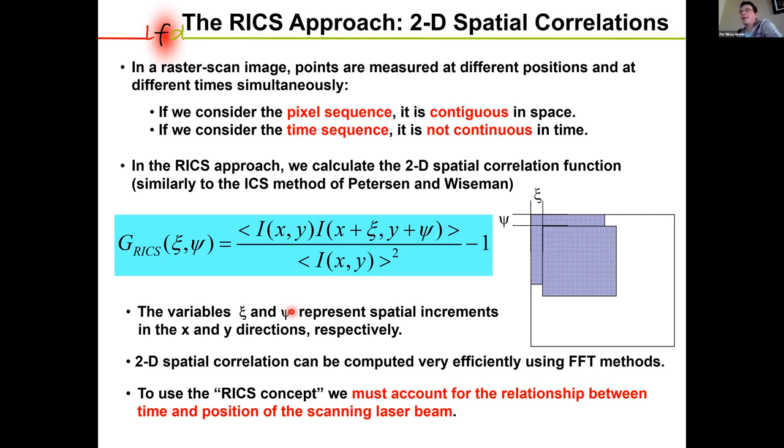So as we have seen before, it's quite a lot of calculations. You have to do this for all pixel shifts, for all line shifts. So you may think, oh, maybe this will take a long time. But you can calculate this very efficiently, actually, using fast Fourier transform algorithms. So a typical image series of 100 frames and 256 by 256 on modern computers, the calculation is almost instantaneous, only a few seconds or sub-seconds.